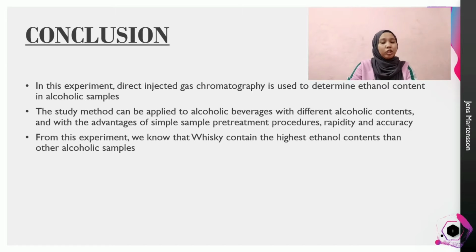Assalamualaikum, my name is Syafiqah and I'm going to continue with the last part, which is the conclusion. In this experiment, direct injected gas chromatography is used to determine the ethanol content in alcoholic samples. This method can also be applied to alcoholic beverages with different alcohol contents, with the advantages of simple sample pretreatment procedure, rapidity and accuracy. From this experiment, we also know that whiskey contains the highest ethanol content of the alcoholic samples.